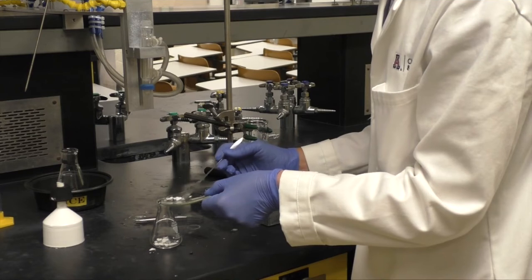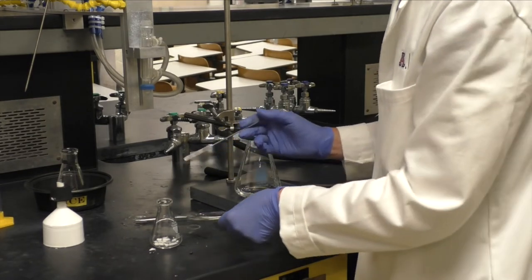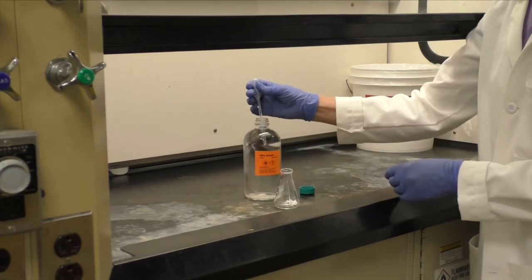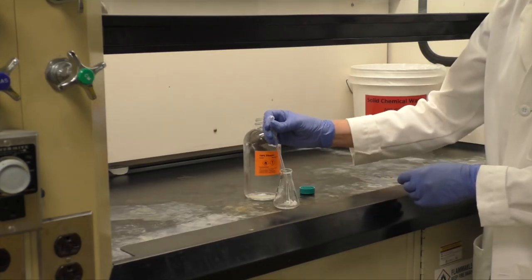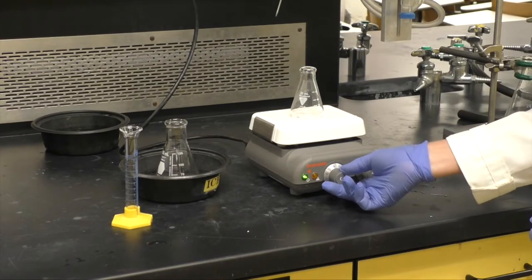To purify the product, transfer the crystals to a clean, dry 50 milliliter Erlenmeyer flask. Add 1 milliliter of 100% ethanol and warm the flask until all the solid dissolves.